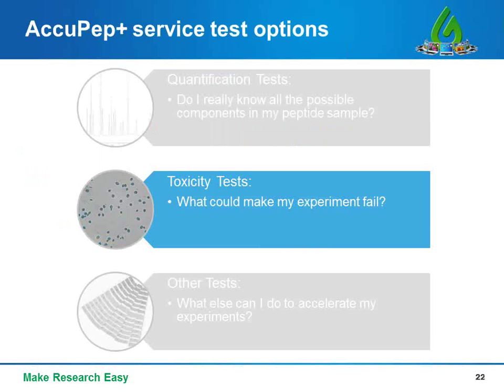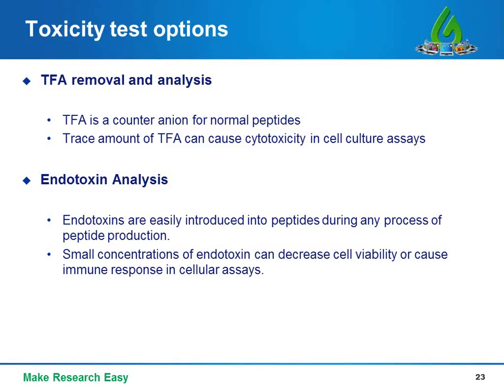Moving on to the toxicity test part: what could make my experiment fail? We explore two main components in custom peptide samples that may be toxic for your bioassay. In the toxicity test, we examine two potentially toxic components — TFA and endotoxin — and provide two test options: TFA removal and analysis, and endotoxin analysis. It has been reported that trace amounts of TFA can cause cytotoxicity in cell culture assays, while endotoxins are usually introduced during peptide production since clean rooms are not available in any production process.